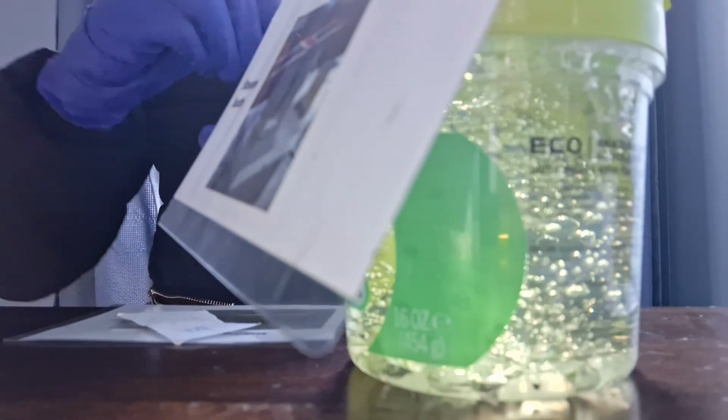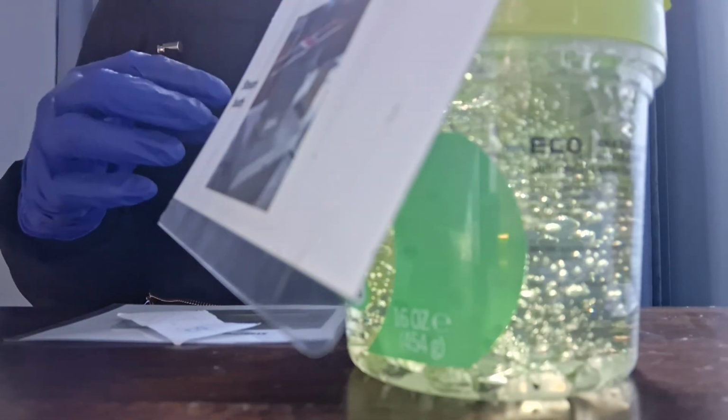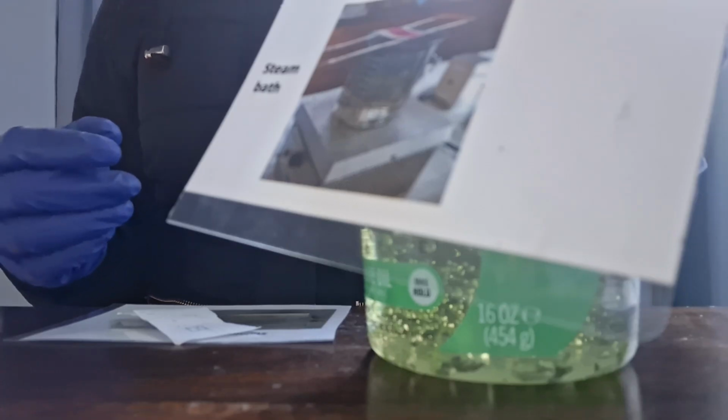The endospores are thick and have protein that makes them resistant to heat and chemicals. So we have to use the steam bath to soften and open the top keratin coat of the endospores to allow the malachite green to penetrate. The heat will enable us to do that.